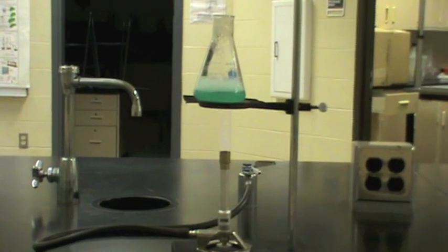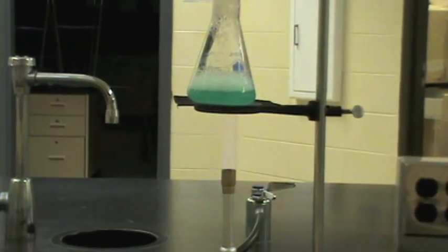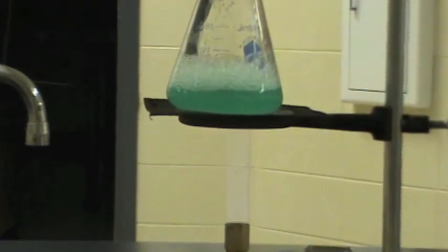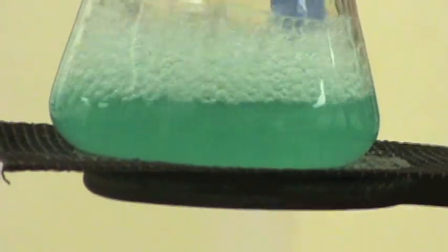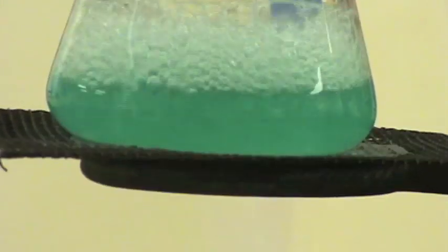Kind of sad, but many students reach chemistry having never used a Bunsen burner. This is why one of the first things we do in chemistry each semester is a simple lab that uses one. I generally take a bit of lab time to show students how to properly light the Bunsen burner, so I decided to make a video showing the proper method of lighting a Bunsen burner for anyone that wants to check it out.